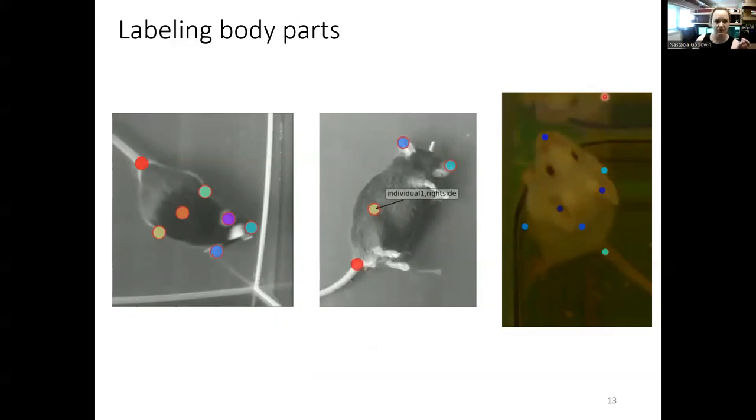For my specific work, I think it's really important to keep whole shape on this animal, so like how fat it is when it's standing up. And so I have nose, spine, and then these side points aren't on the hips like they would normally be when the animal's flat. But I really just want to keep information on the full size of the animal. So where you're labeling can change a little bit depending on what information you need fed into your model.